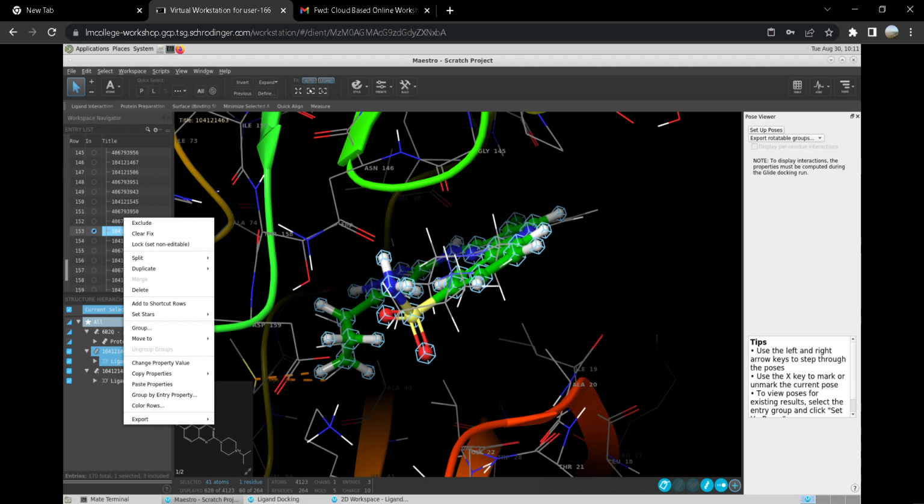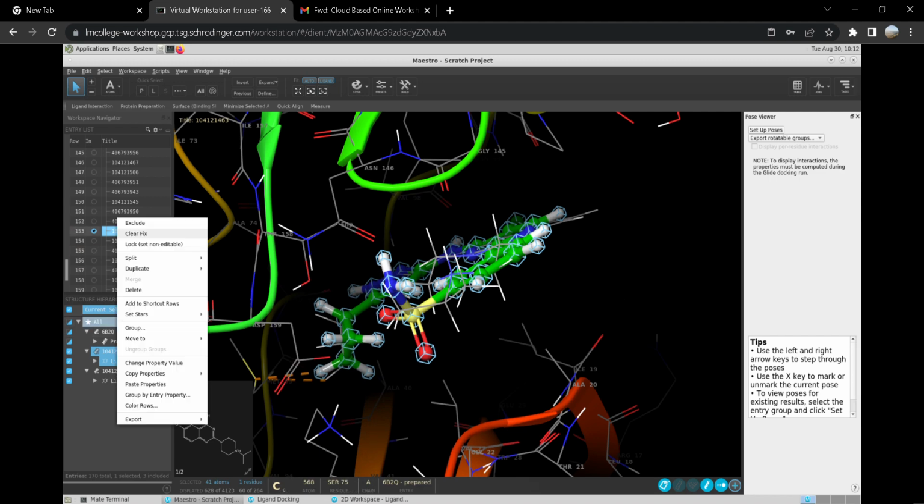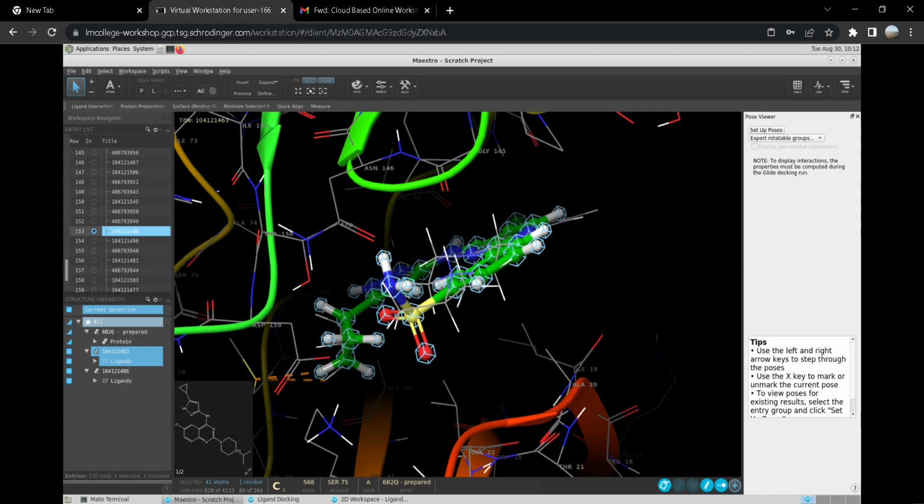So if you are aware of Lipinski rule of 5, Lipinski rule of 5 says that the number of donors, the number of acceptors, the molecular weight, and log P should be multiples of 5, and they have different ranges for it. So you can see where this molecule falls particularly, you can see that log P is 2.3 for this molecule, and the recommended range should be from 0 to 5. The number of donors is 3, the recommended range is 0 to 5. The acceptors are 7, and the recommended range is 0 to 10. And you can also see the molecular weight and the polar surface area.